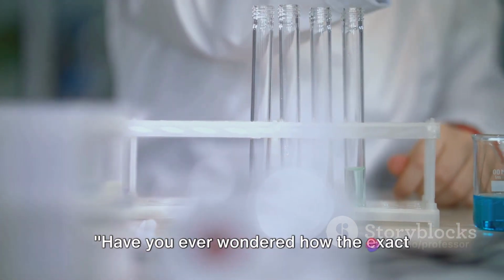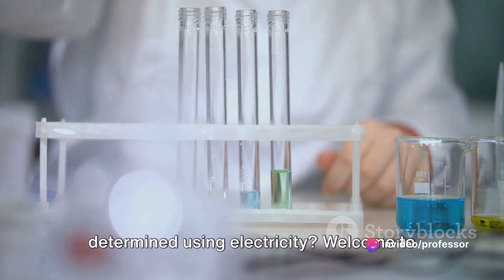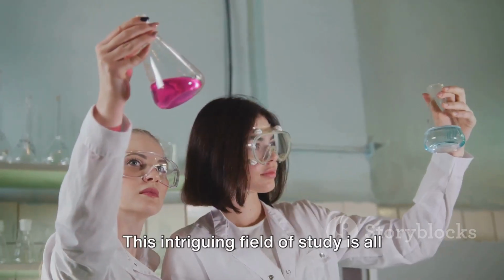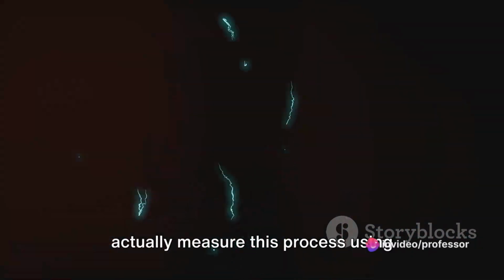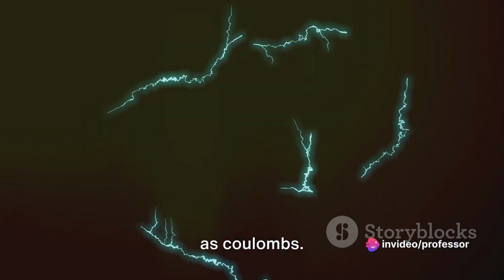Have you ever wondered how the exact amount of a substance in a solution can be determined using electricity? Welcome to the fascinating world of coulometry. This intriguing field of study is all about the transformation of matter through electrolysis reactions, and how we can actually measure this process using electricity, specifically in units known as coulombs.